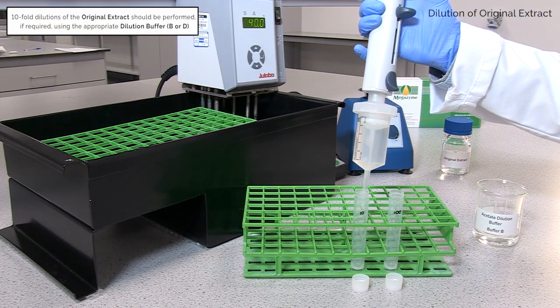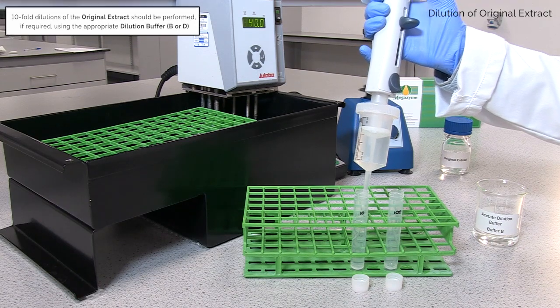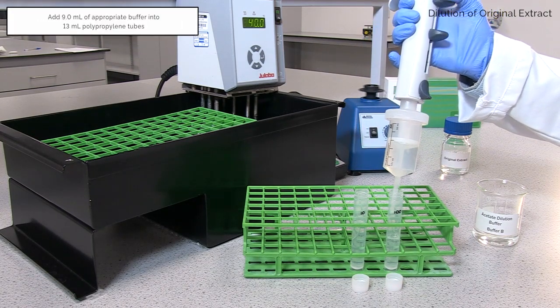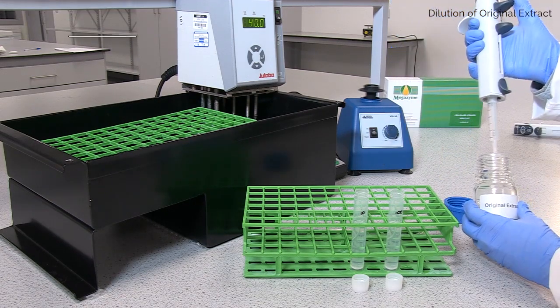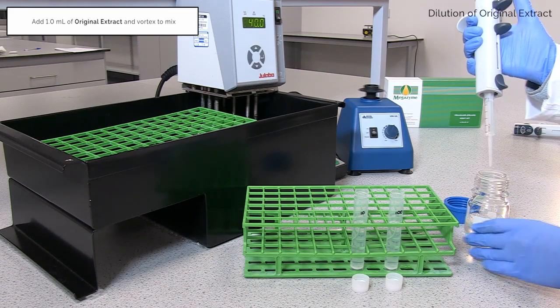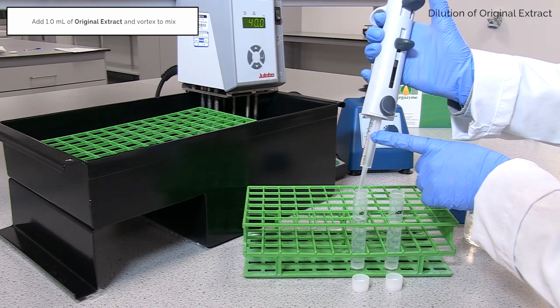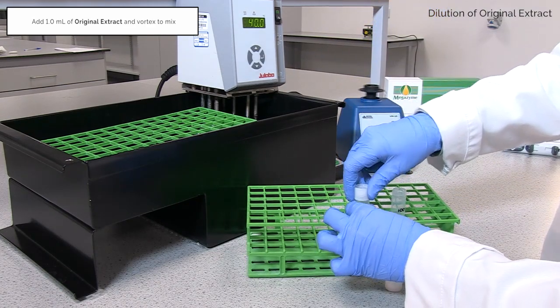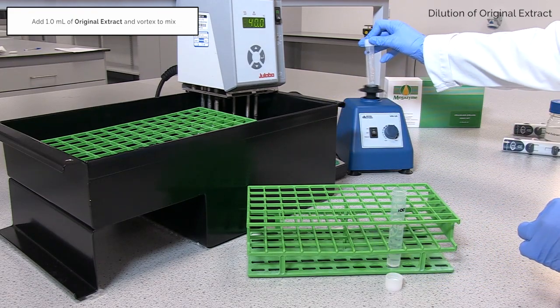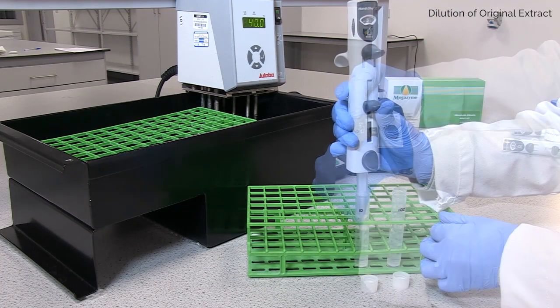10-fold dilutions should be performed if required using buffer B or D. 1 millilitre of original extract should be added to 9 millilitres of appropriate dilution buffer in a suitable size polypropylene tube and vortex to mix. 10-fold cereal dilutions can be prepared in this manner.